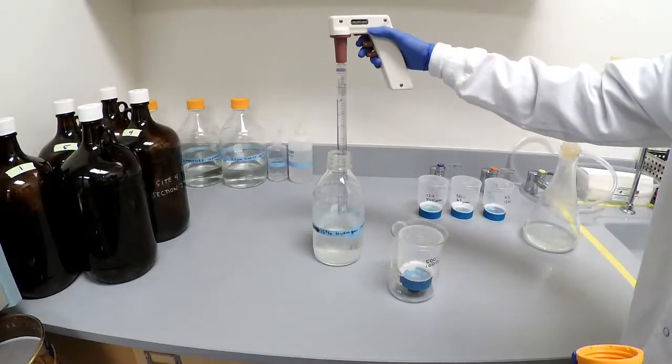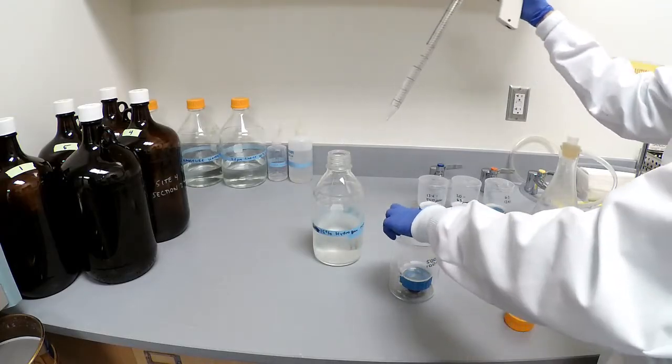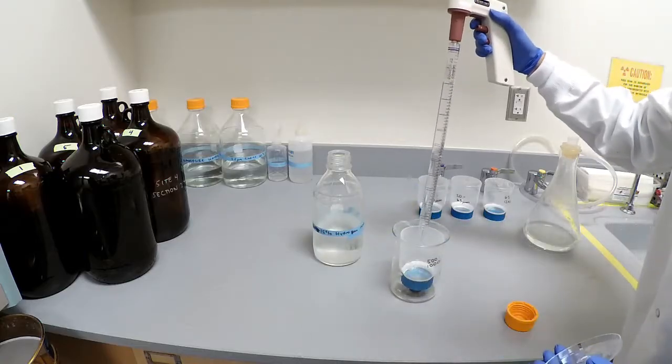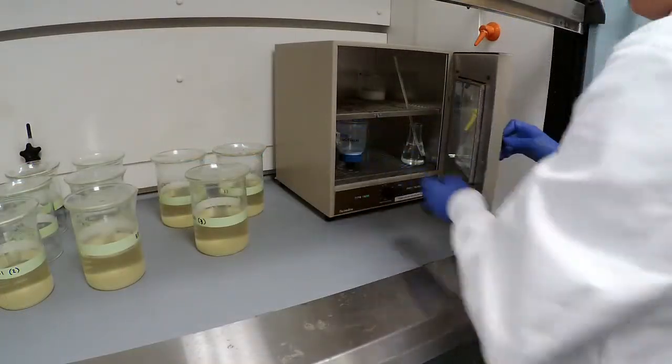Add 30 ml of 15% hydrogen peroxide to the filtering unit. Place the beaker in an incubator for 16 hours at 50 degrees Celsius.